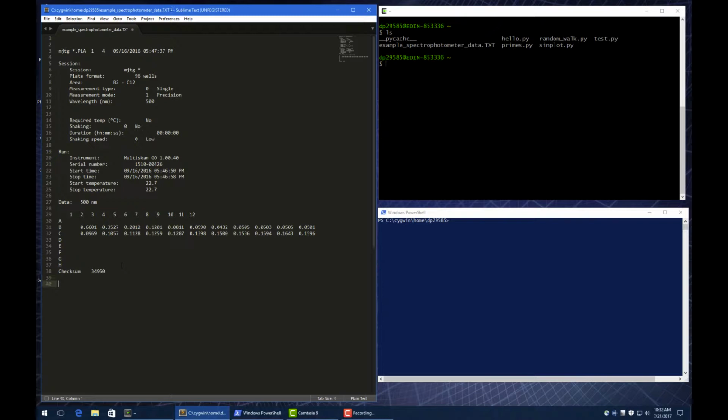So down at the end of the file, we know that on line B here, this is my standard curve, if you guys remember from the experiment. And on line C, this is actually my experimental data. And so I want to somehow tell Python that that's what these things are. So I'm going to make a line that's called standard curve definition. That's going to be a new section of this file that will define the standard curve. And then I'll have another one that I'll just call data definition.